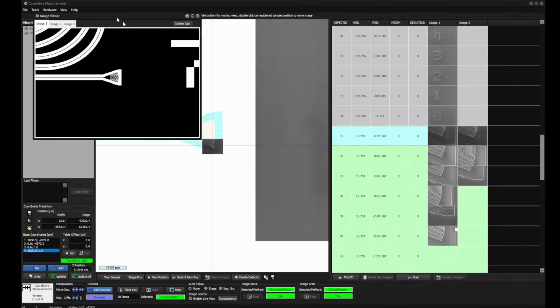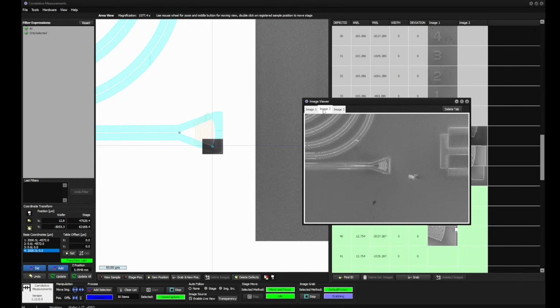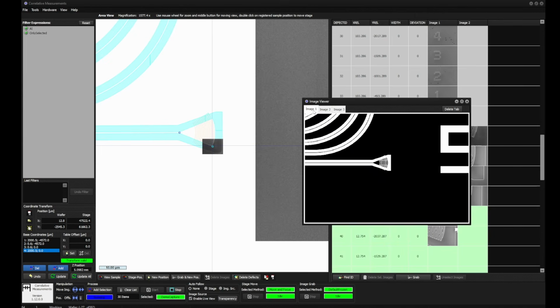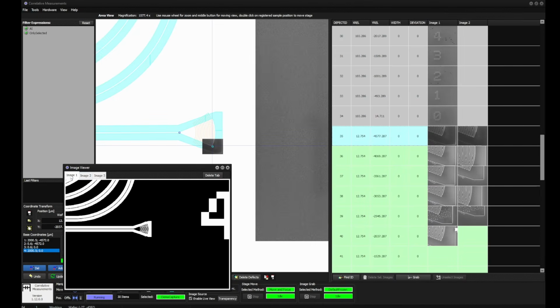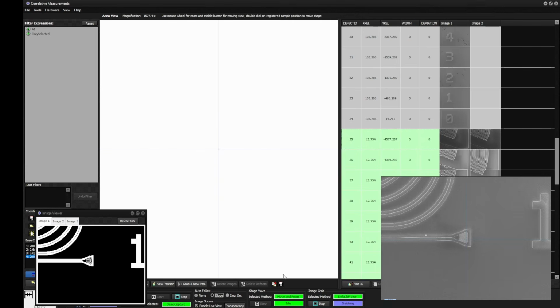And when we go to the CorrMeas, you can see here my script actually creates two images. We have the virtual GDS file image and we have the real image, and you can see there's a shift in between, and we can also see the correlation, which has the single point here, and therefore we can always watch this. This is just a view that comes from the state. I have just added this so that you can see a little bit better what happens here. You can see it a little bit working now. Watching how this works, we follow this.